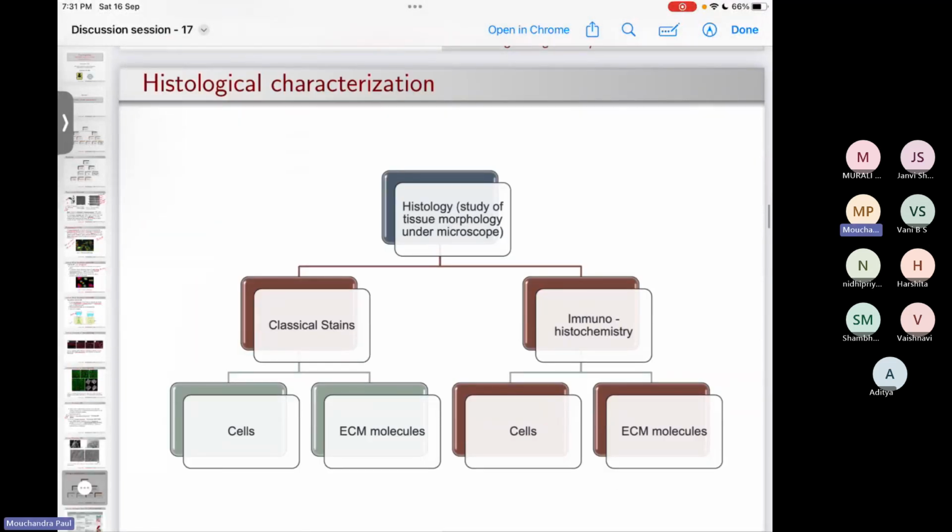So now you have understood how you can use various kinds of microscopy for understanding cellular morphology and cellular structures at different resolutions, at different depths, for 3D or 2D samples. These are all very useful for in vitro studies. We have not yet gone to in vivo studies.